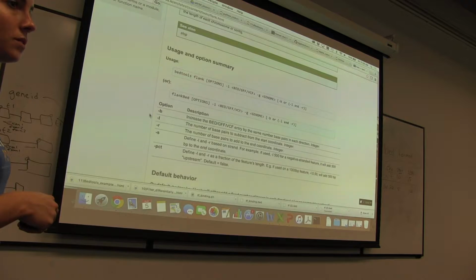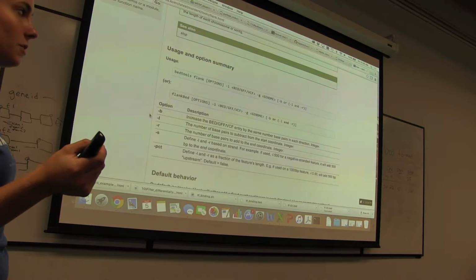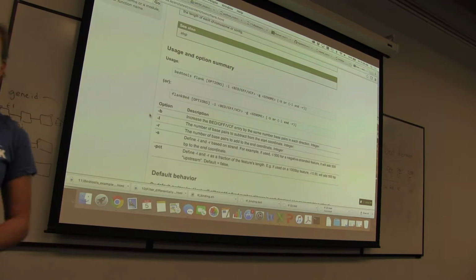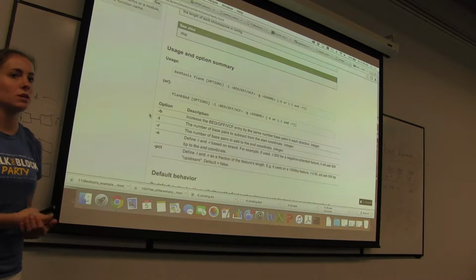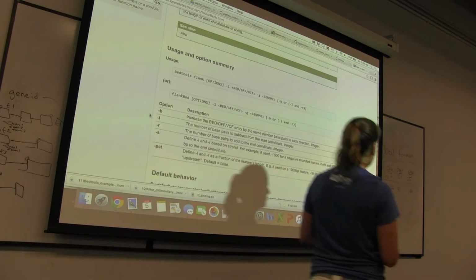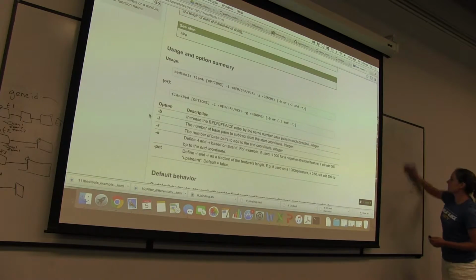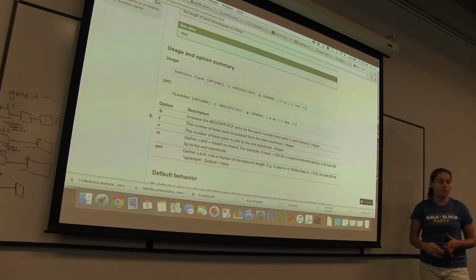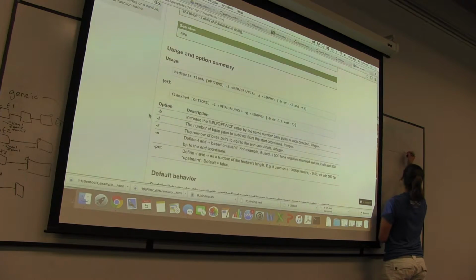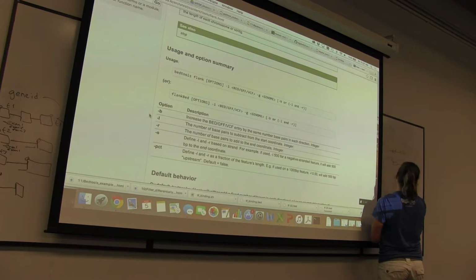We do. So you have to keep in mind where the stranded information is coming from. We're looking at gene transcripts. Gene transcripts are transcribed in both directions. If we want to go upstream of the transcript, we need to specify if that transcript is on the positive or negative strand, because upstream, this is why the RNA field is really annoying. You always run into this nonsense, but let's take care of it. So if the genome direction is this way, and you have a gene that's being transcribed in this direction, upstream of this gene is here.